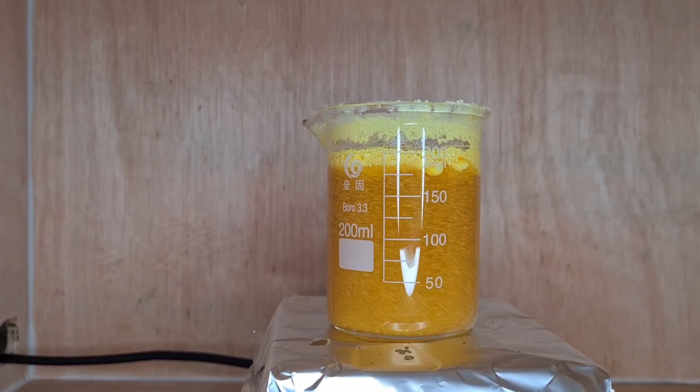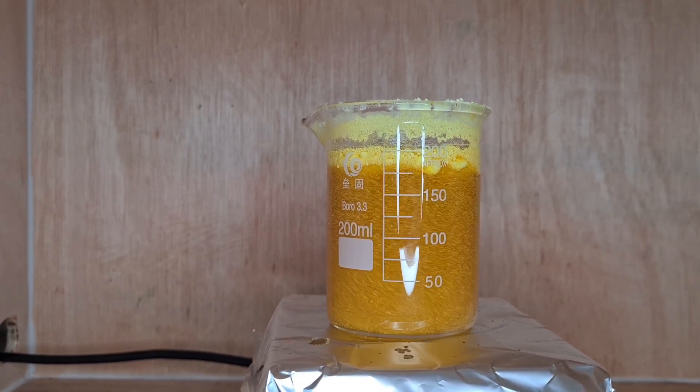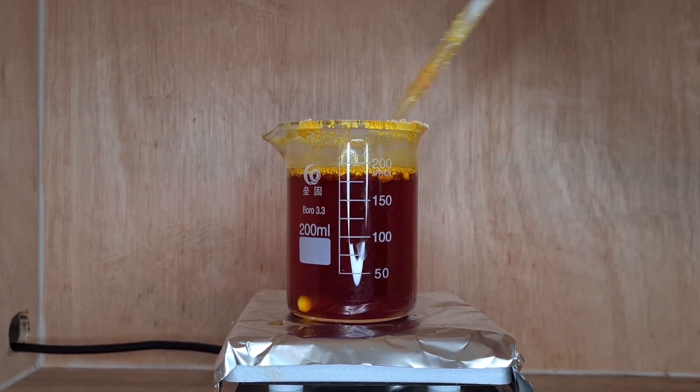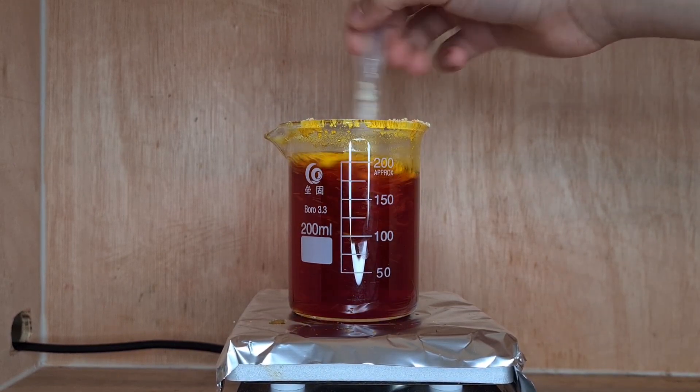Over time, more and more sulfur dissolves and it turns into this orangey-red solution. When it turns red, there's very little sulfur left and I just have to stir it more and more until all the sulfur dissolves.